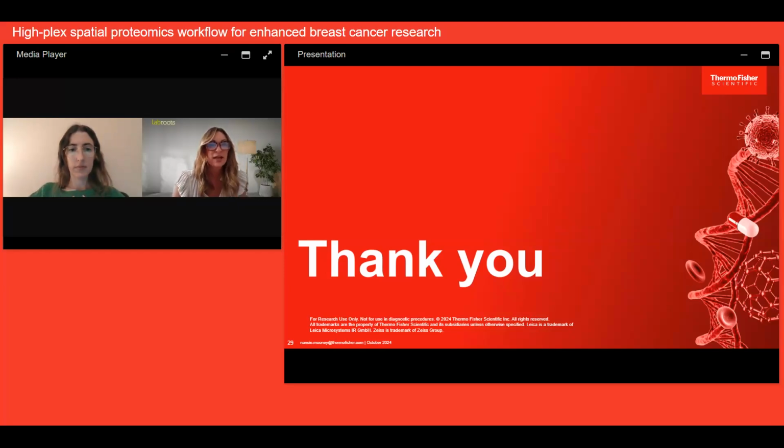Let's see. Is there any particular benefit of using the EVOS S1000 system versus, say, the Zeiss Axio Scan? In other words, is it filter set that is pre-configured for these fluors or filters, and are they customizable for the EVOS S1000? Sure. So I'm not as familiar with the Zeiss Axio Scan, so I can't speak so much about the comparison. But again, the EVOS S1000 system is set up to be a spectral imager.